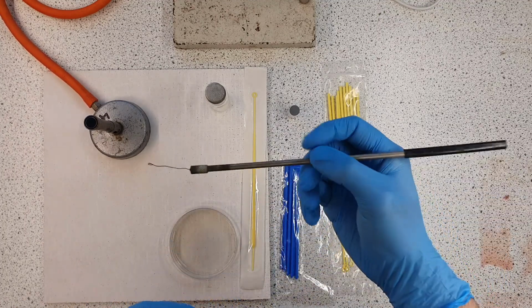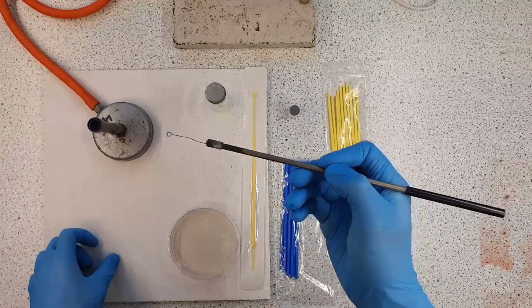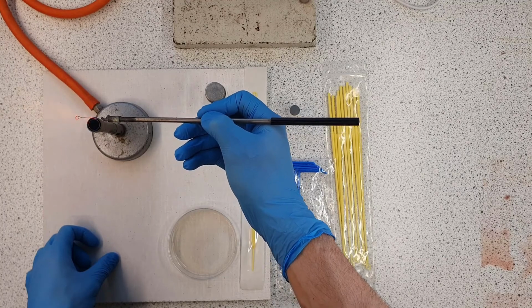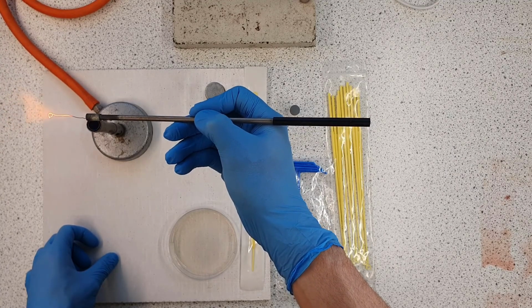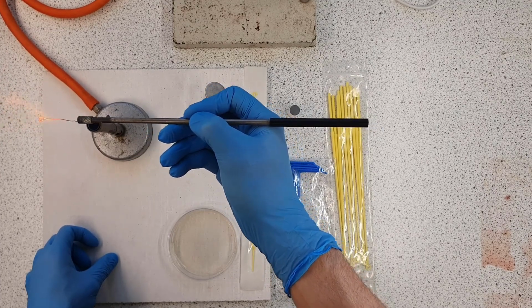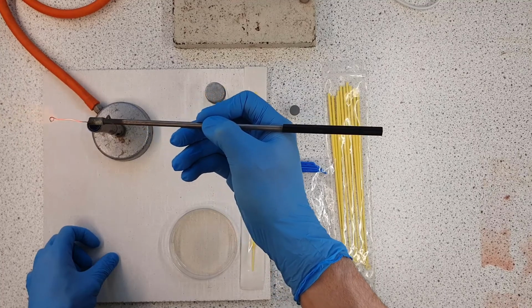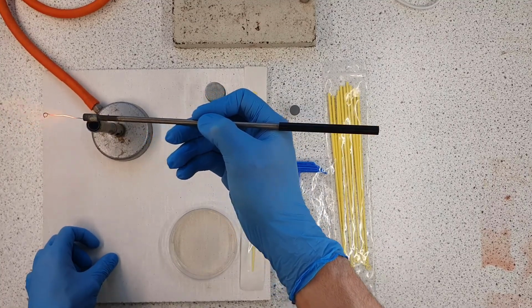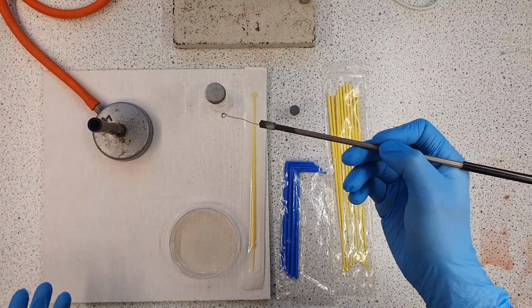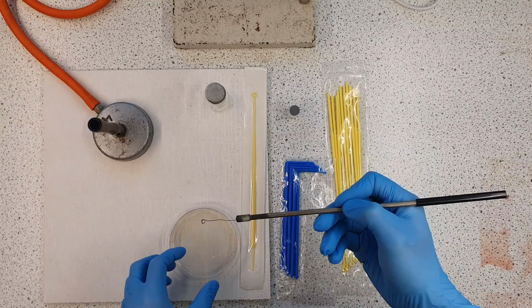So, you're going to hold it like you would a pen, as close to horizontal as you can, and we're going to hold it in the flame, gently, up to the hottest point of the flame. Make sure that loop, as you can see there, is red hot, and you want to make sure the entire length of that wire is nice and hot, just to kill any spores or bacteria or fungi that may have snuck on board. Then we'll leave it to cool down for a bit. Sometimes you will have a jar of distilled water to cool it down in, but we can just wait a few seconds to let the wire cool.